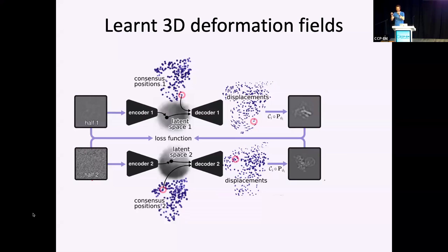because we place multiple Gaussians in real space, and the decoder of our VAE predicts displacements of these Gaussians, which are pseudo-atomic models of our density. Then we make projections of the displaced Gaussians with the forward model and try to minimize the loss, comparing these to the experimental images.